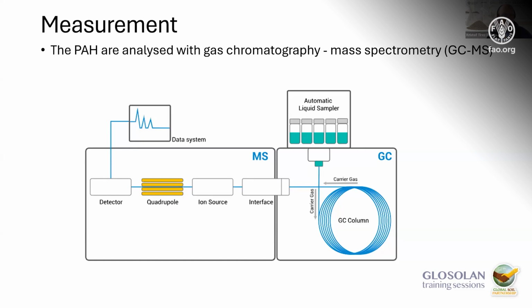Yes, I think a very important aspect of the method is that you said you add these internal standards. You use the deuterated ones for the different compounds. Is this a regular practice internationally, and how much is added? Because you say at least 5. What does the standard say about how much and which internal standards you have to use?